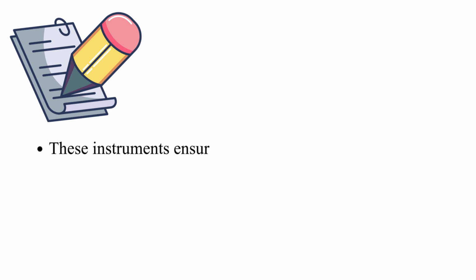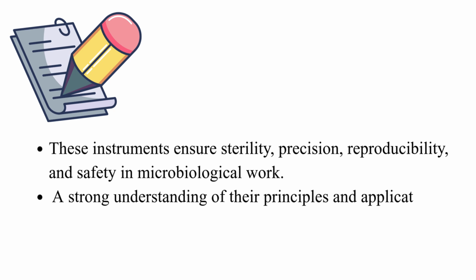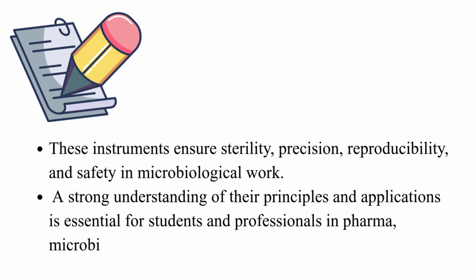Conclusion: these instruments ensure sterility, precision, reproducibility, and safety in microbiological work. A strong understanding of their principles and applications is essential for students and professionals in pharma, microbiology, and quality control.